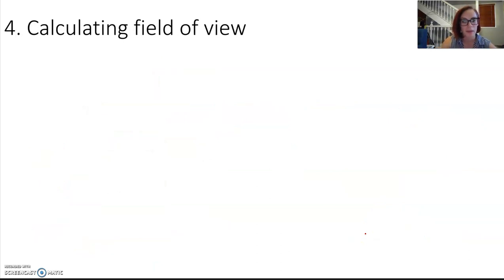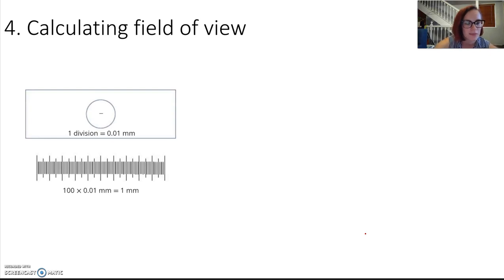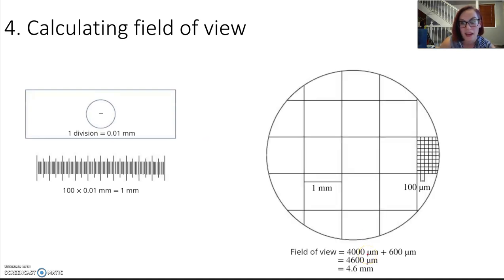Calculating field of view should be skill number three. My apologies for mislabelling that slide. So in order to do this, we need to have a think about, we're looking down the microscope, we can see this round thing, and we are trying to say, how big is this actually? In real life, how much are we looking at here? And this is called a stage micrometre slide, and we can find out the size of the divisions. This tiny little line in there is actually, when zoomed in, it looks like this, and we can find out exactly how big our stage there is. You count the number of divisions across the diameter of field of view. So in this case, one, two, three, four, and about a half there. And you can see they've said, well, if one of these represents 1000 micrometres, then we have approximately 4,600 micrometres, which is about 4.6 millimetres.